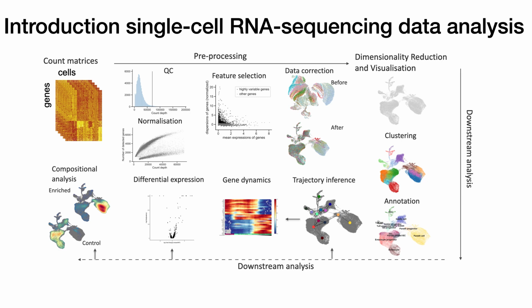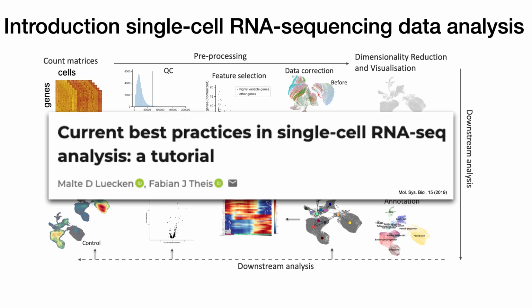So that's just a small outline of what you can do with single cell data. There are always more details. If you would like to read up on this whole pipeline workflow a bit more, I strongly recommend reading this paper from my colleague Malte. It's called Current Best Practices in Single Cell RNA Sequencing Analysis. It also comes with a tutorial that you can try out on your computer, and this course that we are doing today is also based on his course.